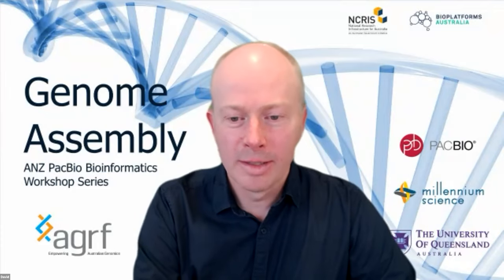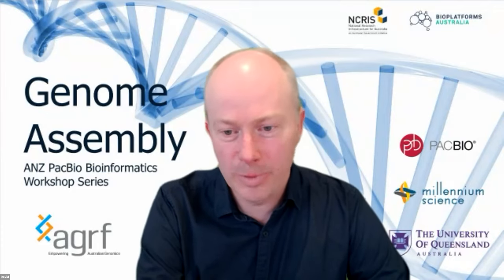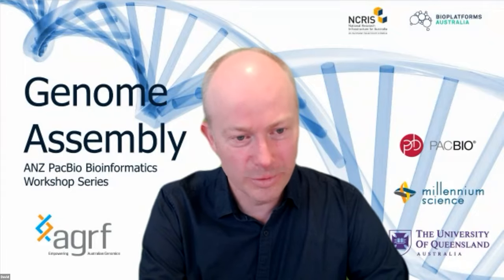One last one. Can you use PacBio magnetic beads for size selection? Interesting. So it's the AMPure PB beads that I mentioned for cleanup. There are some protocols where you use those AMPure beads as a size selection method. It depends a little bit on the size of your inserts. For whole genome sequencing, it's not the recommended way. I guess you have to work with the best you've got, but ideally a Pippin HT or Blue Pippin or something along those lines, or the Sage, is going to get you a much tighter distribution.